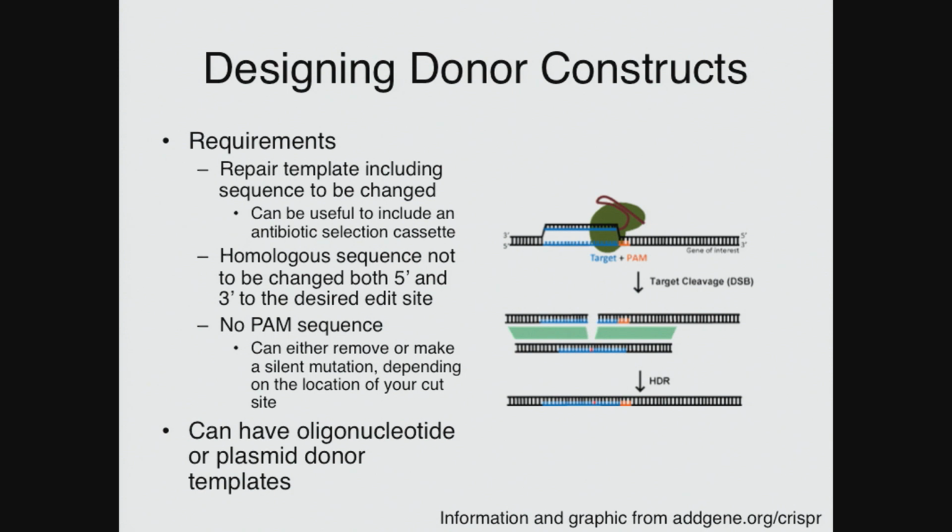And this is so that the donor and the DNA that's being repaired knows that that's supposed to fit in there. So you want it to be able to go to the DNA that's damaged and bind to the sequences around the cut site, but then have this new template that's able to repair.